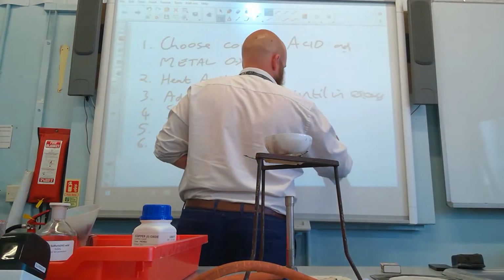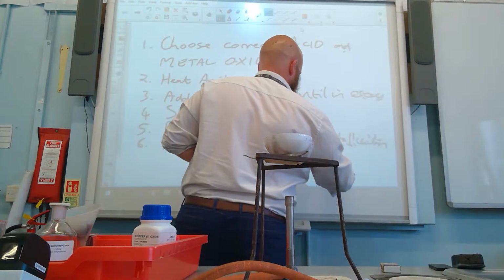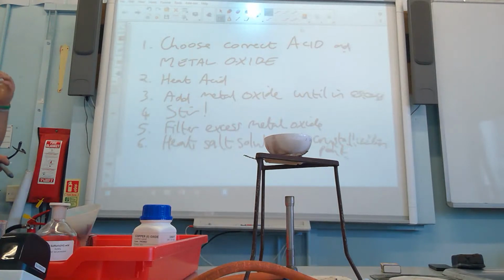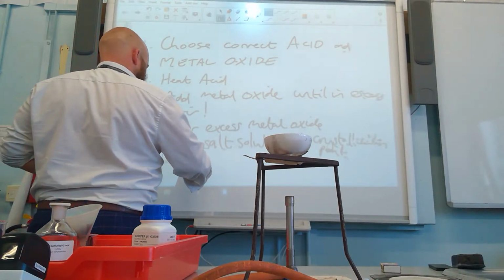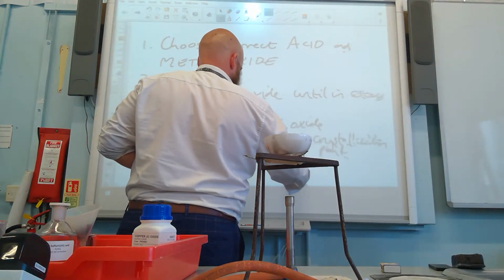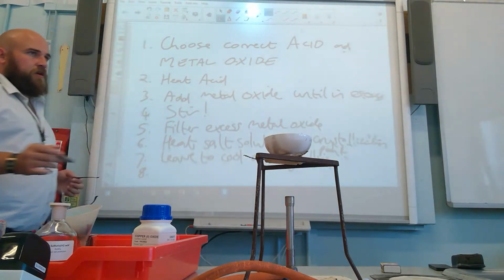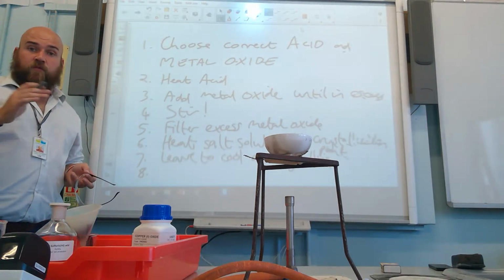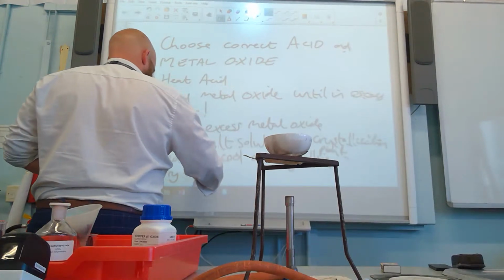Till crystallization point, which is what we've just done there. So I've heated it to a crystallization point, and then we're going to leave it to cool and crystallize. And I think the final step, which we'll do, which I'll record and then I'll share with you in the classroom, is to pat it dry with paper towels.